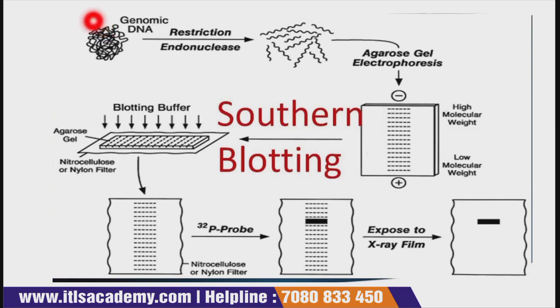So this is genomic DNA. With the help of a restriction enzyme, that is endonuclease, you cut this DNA into fragments and put it into the agarose gel electrophoresis. It has a negative and a positive side, and separation is because of high molecular weight and low molecular weight.